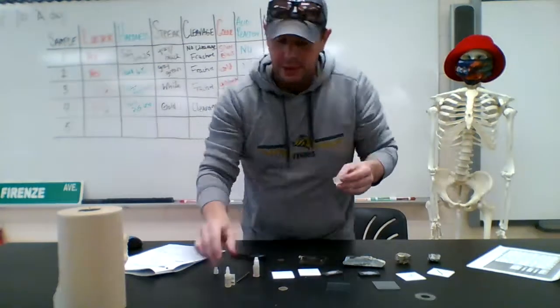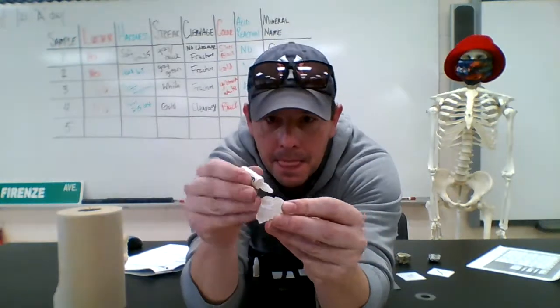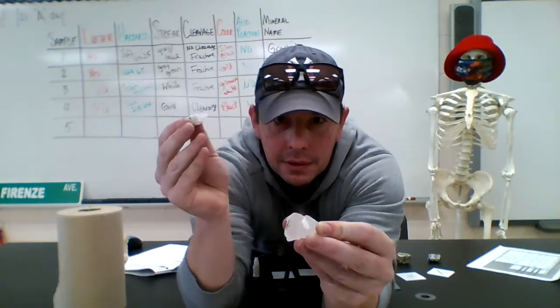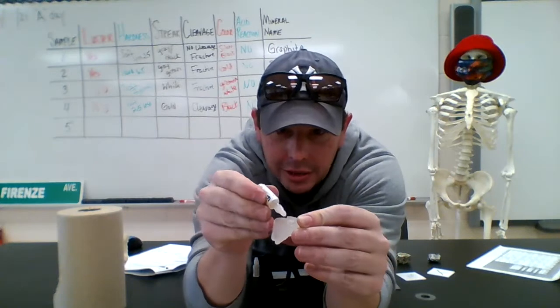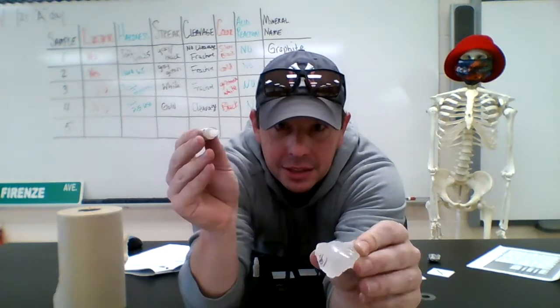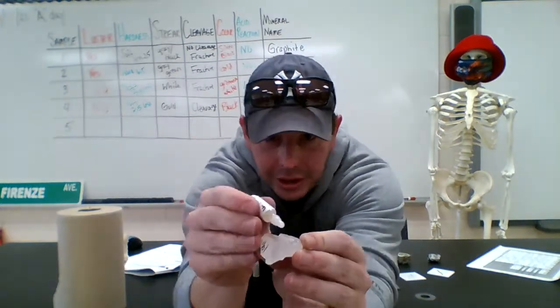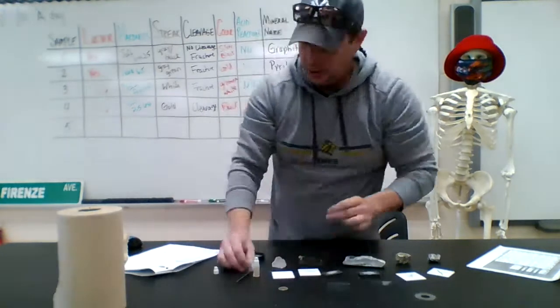Okay. Now my time for my favorite one. Please don't let me down. Here we go. Will it react with acid? Here we go. Bubble, bubble, fizz, fizz. We have a winner. It reacts with acid. You can see it. I hope you can see it. I can't reach any farther to help you see it. It's smoking and bubbling. We got a winner. All right. It reacts with acid.